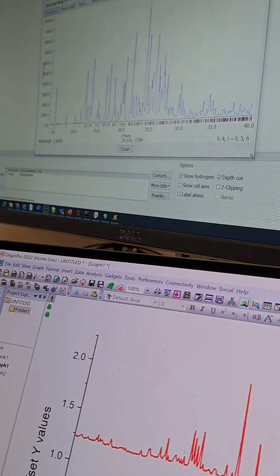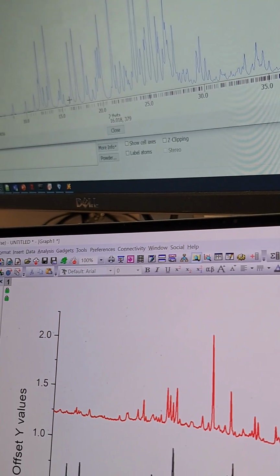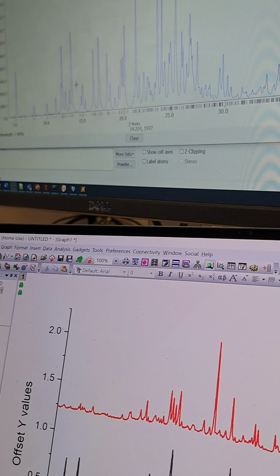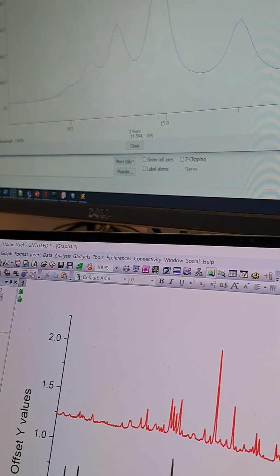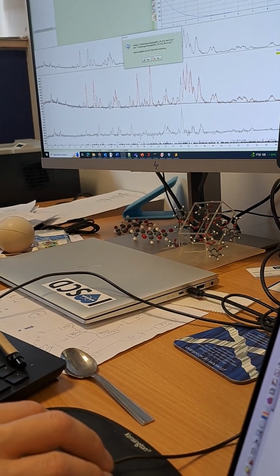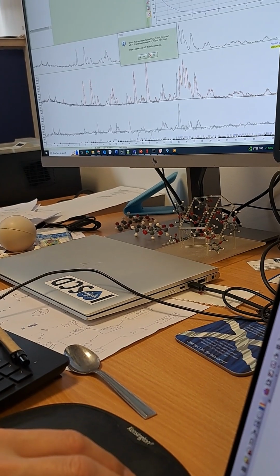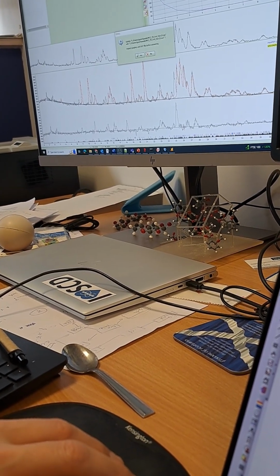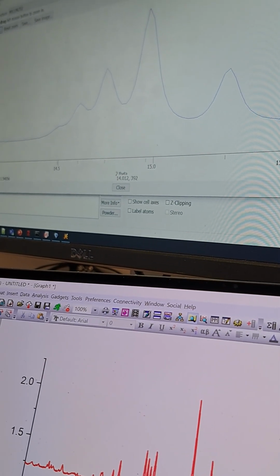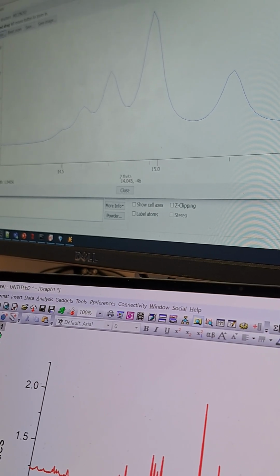So this is what your diffraction pattern should look like. Now what we're looking at is about 15 degrees, and there are 3 kind of peaks. We can start looking around there. You can see that we're misfitting some of this. We've got a couple that are all right and then some that aren't. If you look at that structure, that's kind of what we've got here, isn't it? There's a wee one over there which might contribute here. Then there's one that can add into this little bit here. We've got another one there, and there's probably 1, 2, maybe 3 in here.